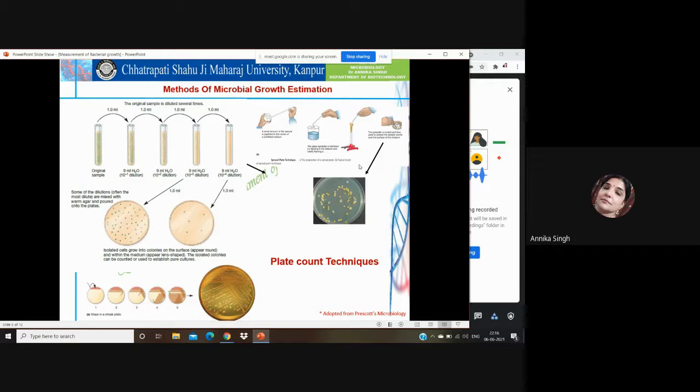Another type of media is known as differential media, which differentiates two types of microorganisms on a culture medium. Particularly it is used for those bacteria which utilize RBC and cause red blood cell lysis, to differentiate them from others which do not cause lysis, and so on.